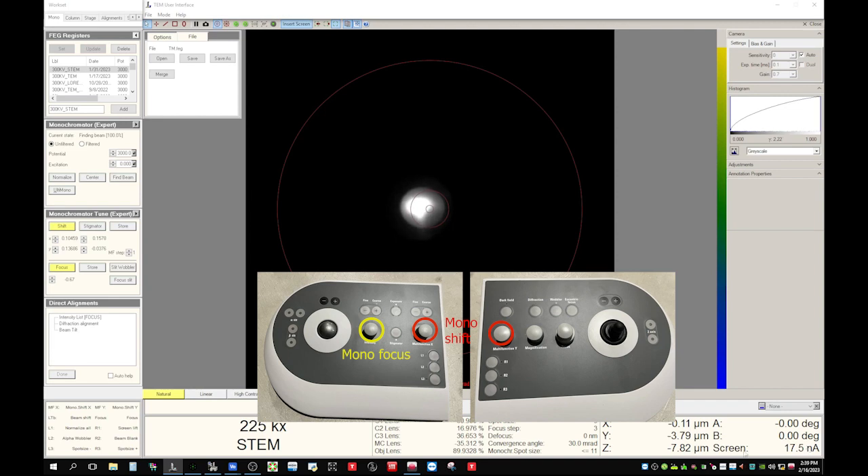For aligning the probe corrector, we want the screen current to be about 150 pico amps. Now let's change the intensity clockwise — the screen current drops down and the focus number increases. Keep doing that. Now we get 151, so that's good. We don't have to be exactly at 150. Now I'll turn off the shift and focus.